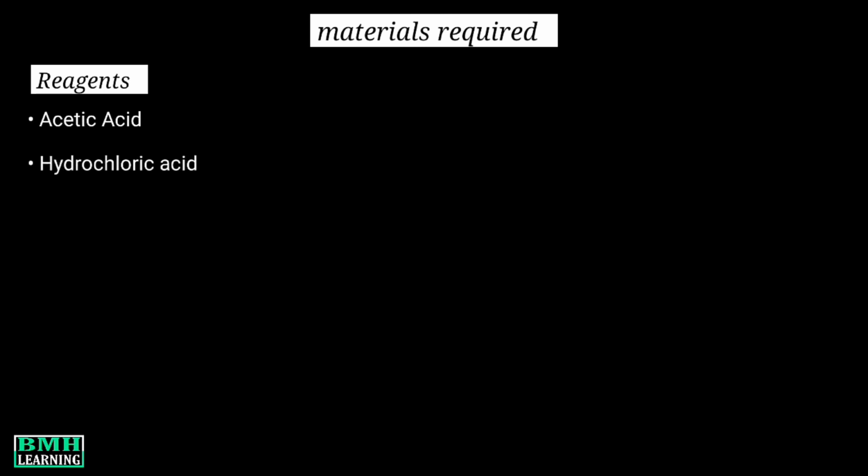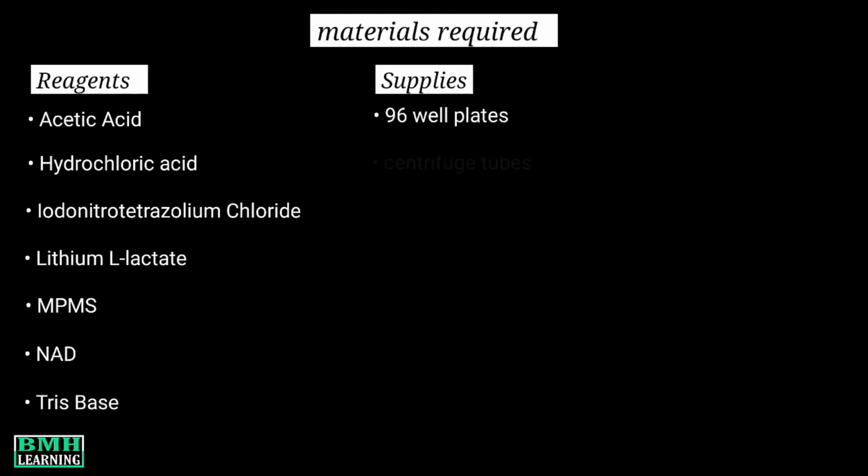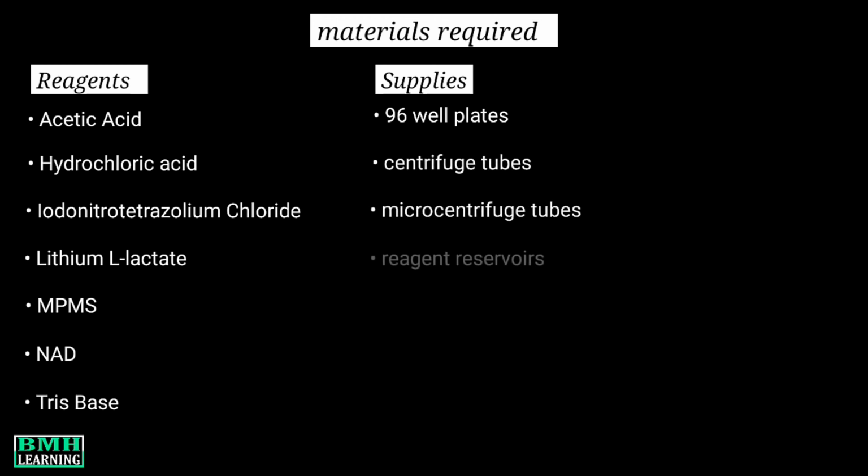Materials required: reagents, acetic acid, hydrochloric acid, iodonitrotetrazolium chloride, lithium L-lactate, MPMS, that is methoxyphenazine methosulfate, NAD, tris-base, 96 well plates, centrifuge tubes, microcentrifuge tubes, reagent reservoirs.